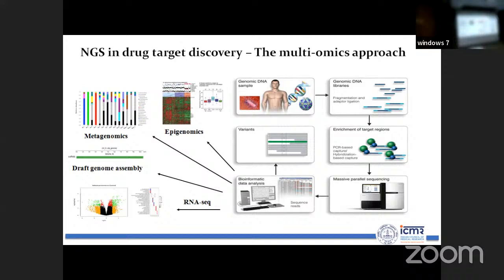But what happens, say for example, you are sequencing human as well as virus. If you are collecting samples from human, it is likely that you will get more of human instead of virus, because human genome will be predominant, right? So in shotgun metagenomics, you can get whole genome. But when you are going for amplicon-based metagenomics, you will get only marker genes: 16S RNA, 18S RNA, or ITS regions.